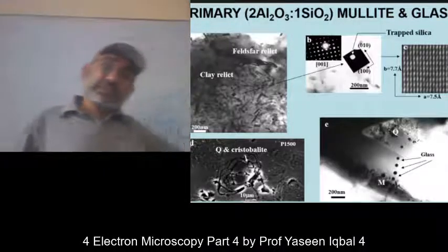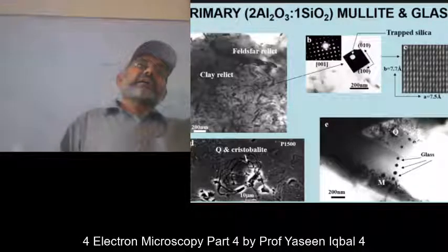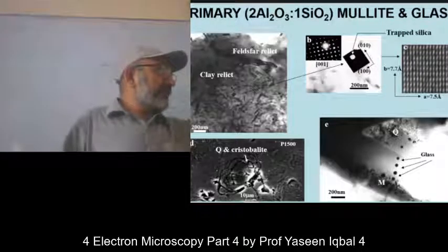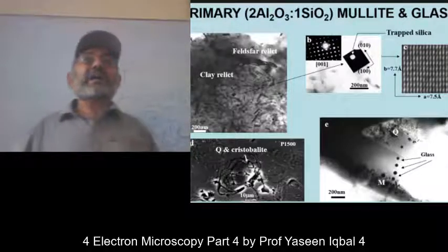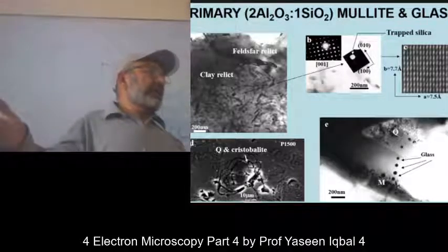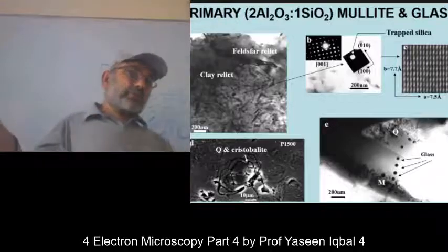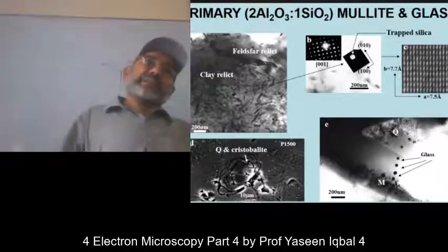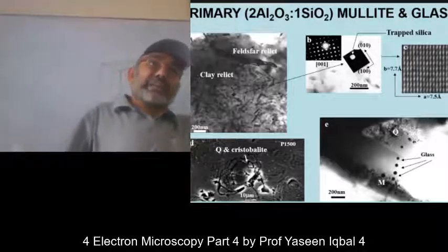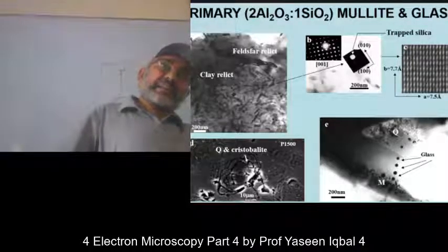right? So it takes you from the macroscopic world up to the nano and angstrom scale world of material. And it tells you about the huge nature of your universe. That when you go into a very 3 millimeter disk of a sample, it has a complete world of its own in it. And only transmission electron microscopy can take you there.